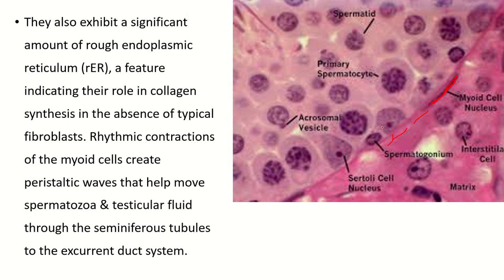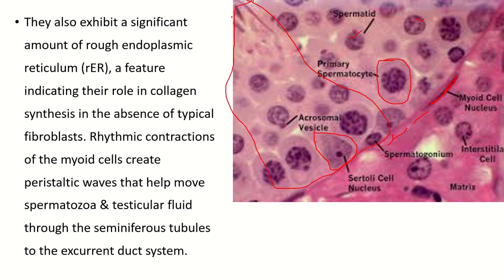Here you can see the other cells of the seminiferous tubule — all of these are spermatogenic cells. This is the primary spermatocyte; it is the biggest spermatogenic cell. However, the biggest cell of the seminiferous tubule overall is the Sertoli cell. The primary spermatocyte is the biggest cell among the spermatogenic cells.